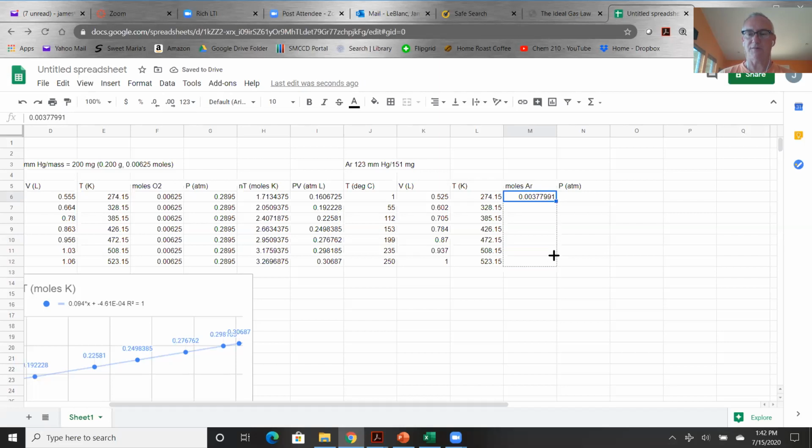We're counting on you, or else if we get this slope wrong, it's going to be all your fault. No, your fault. Please check. All right, I'll check. Anyway, pressure. What's my pressure? Yep, 377991.